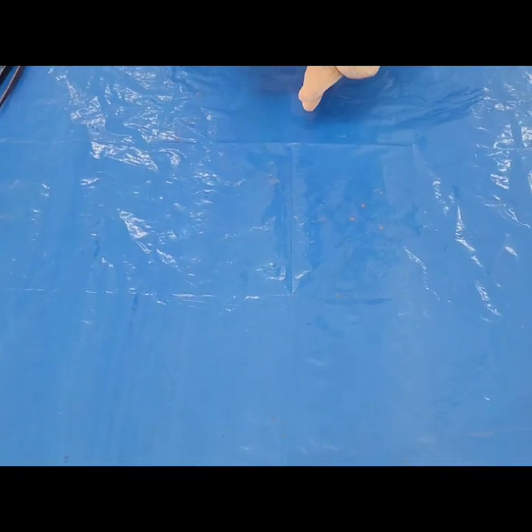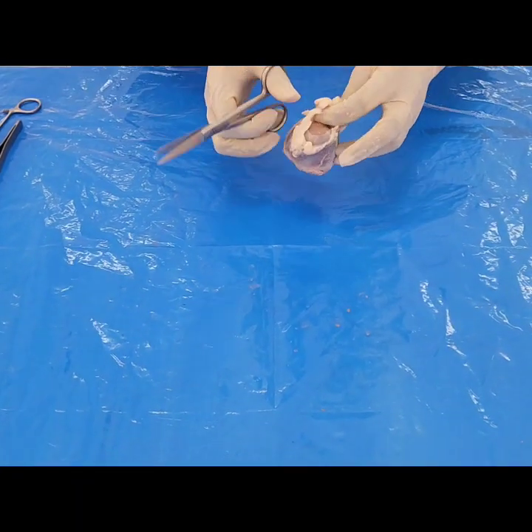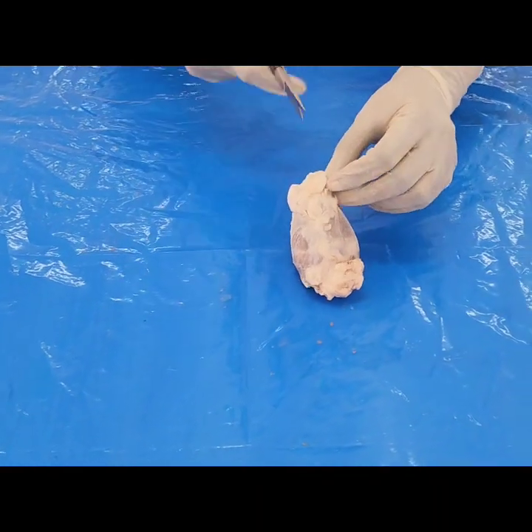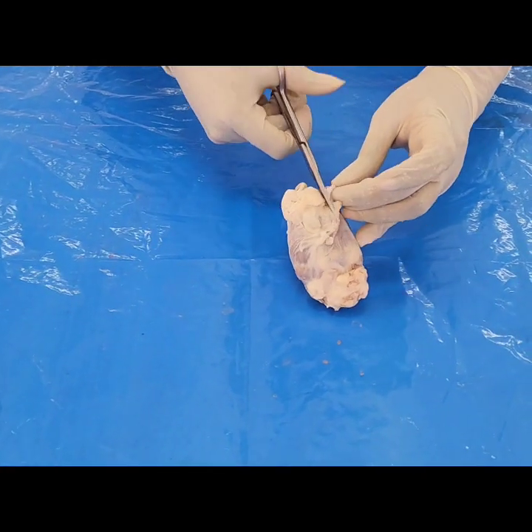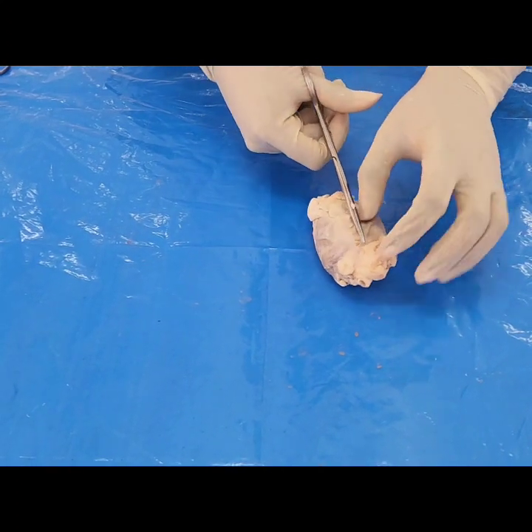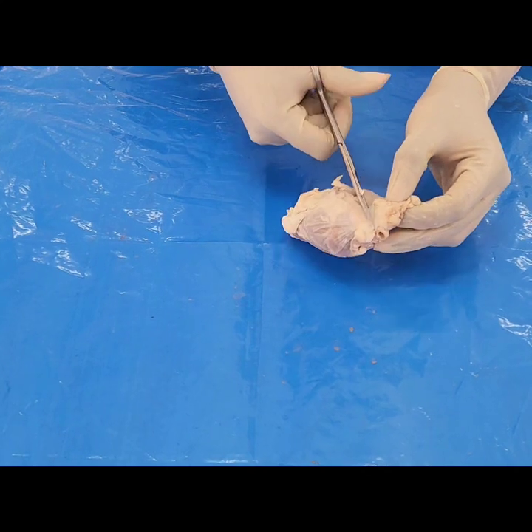This is the heart of a goat. It is covered by the pericardium. We are going to cut the pericardial layer, this outer fibrous pericardium. So we are removing the pericardium here.